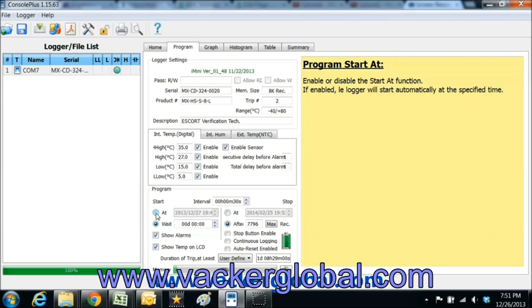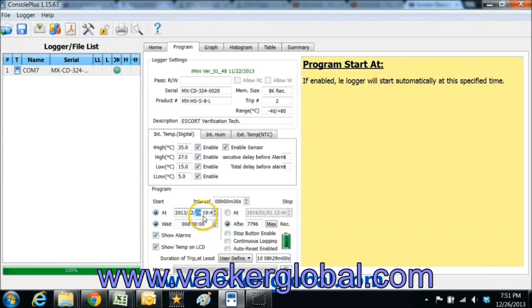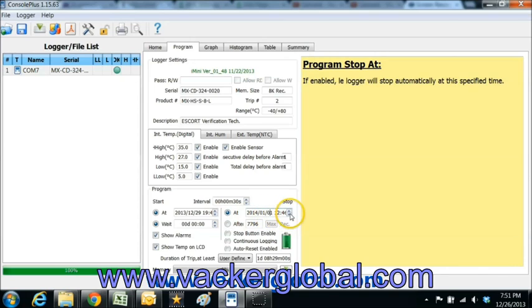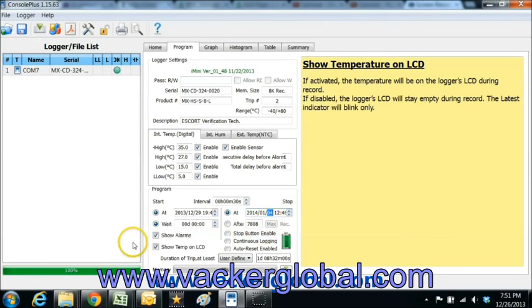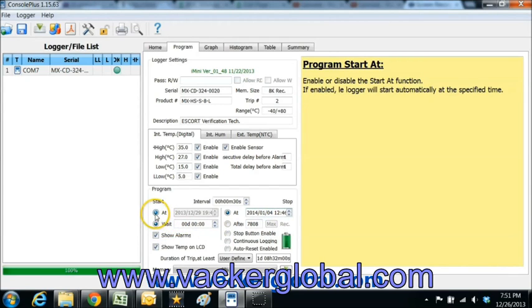Now this left side is for the start functions such as start time, delay time, etc. On the right side you can define how to stop the recording such as at a specific time, after a number of readings, etc.